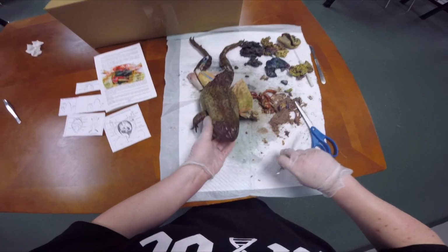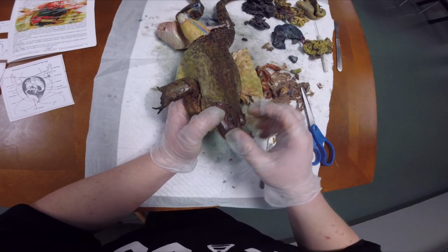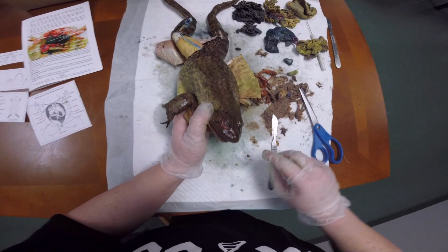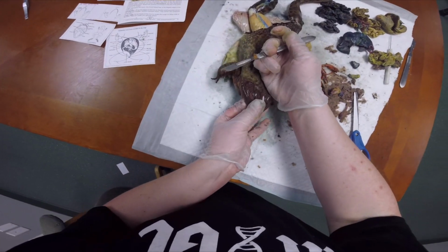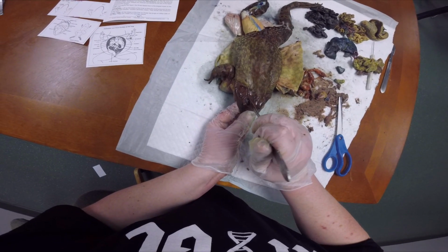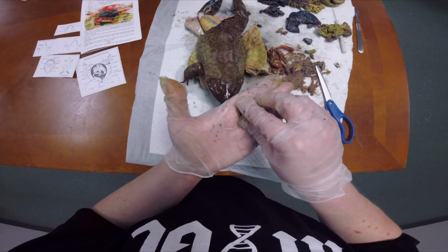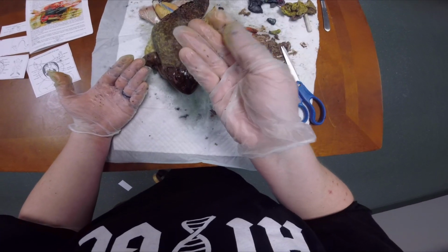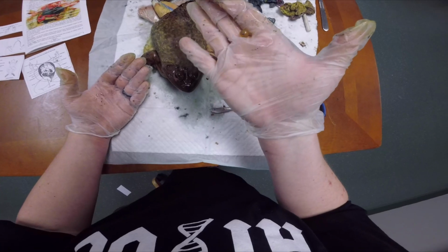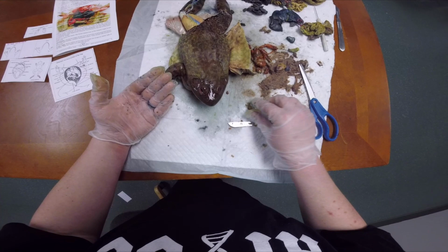So, ta-da! I want to show you the eye. I want to show you the lens. So I'm going to just do this real quick. You cut open the eye. Well, my tricks aren't working this year. Uh-oh. And ta-da! There is the lens. So when the frog was alive, this would have been clear, and it would have looked like a clear marble. Okay, so that is the lens.